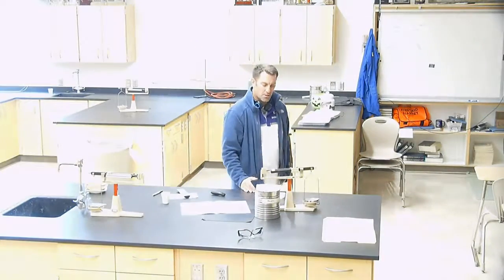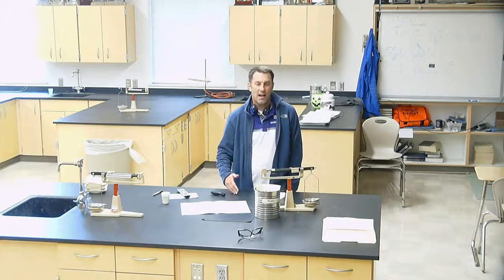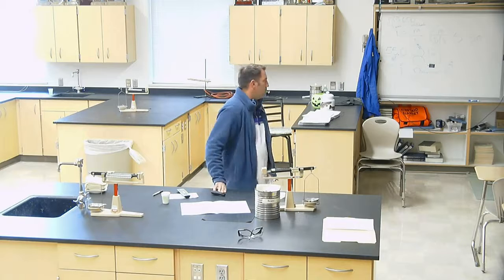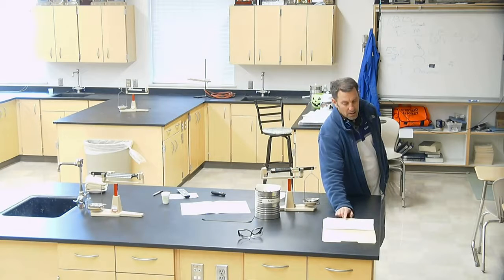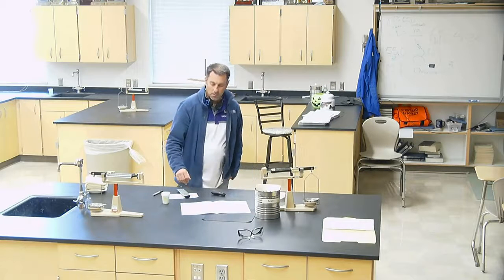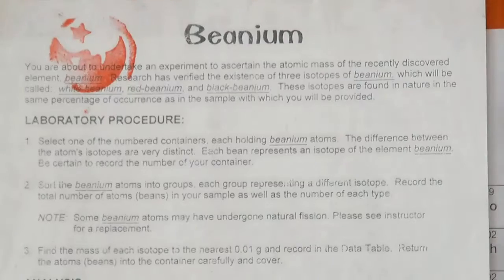So what we're going to do is we're going to look at beans today, red, white, and black beans, and you have to be a very good accountant today for this lab to work out well. You'll notice right here, you can't see, but the instructions for this lab will be here in this yellow folder. You'll need to pick those up and then follow them through, and I have those here also. The camera will kind of span over and hopefully focus on those in a second.